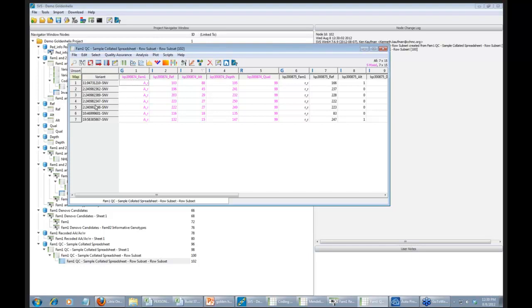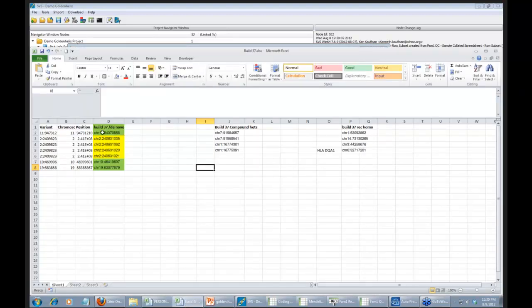As Dan mentioned in the introduction, they're coming out with this new tool called GenomeBrowse, and we can use that tool to actually visualize these candidates to further filter out what looks like it might be a sequencing artifact or to prioritize our candidates. Now I've already put these SNPs in the format that's needed for this tool. And let me show you how this works.